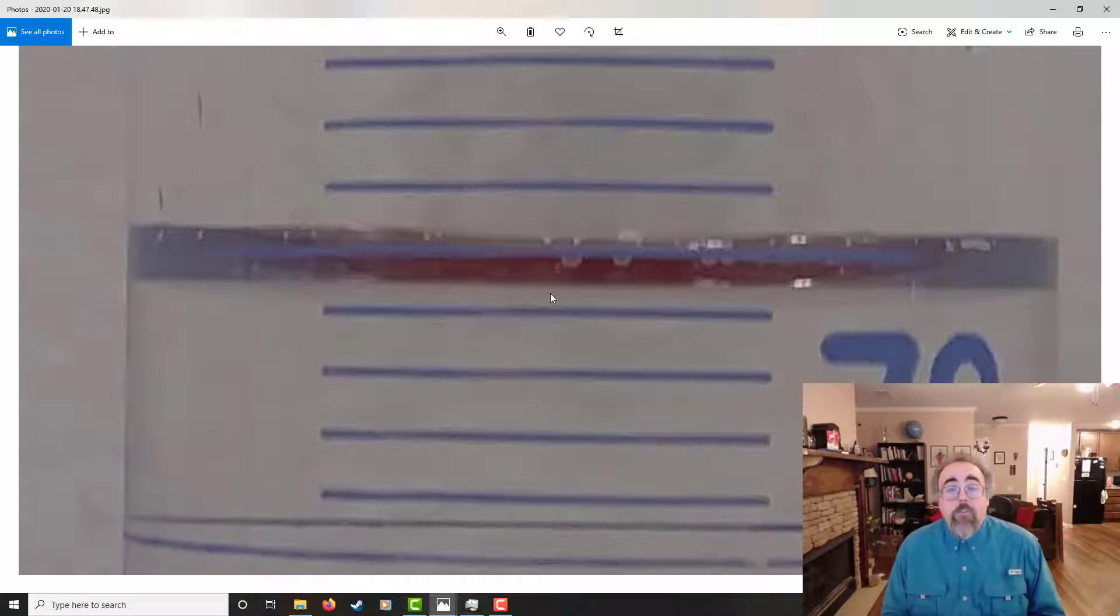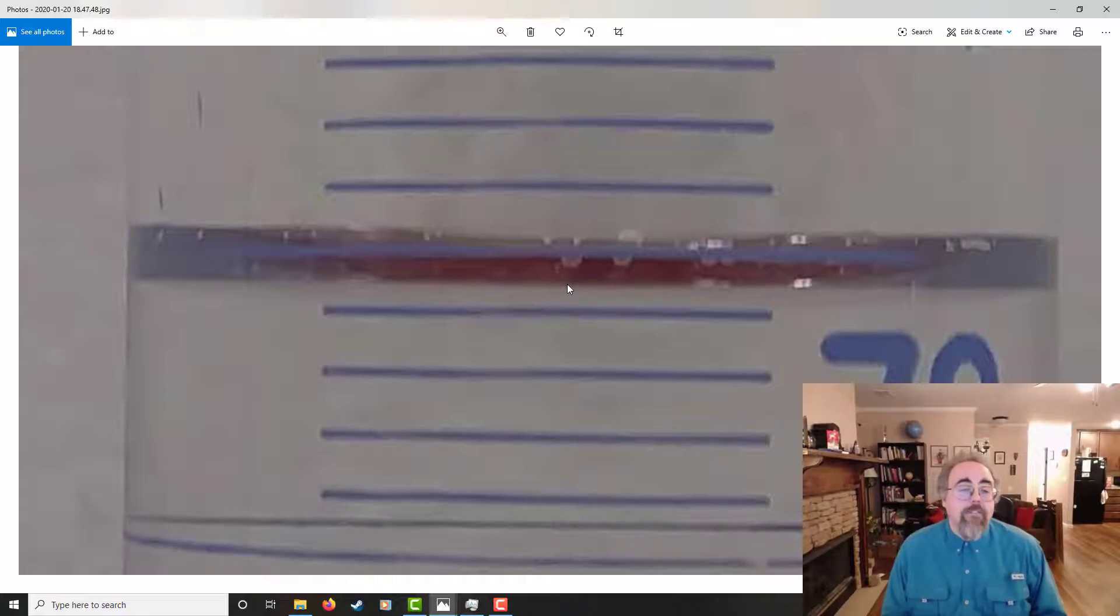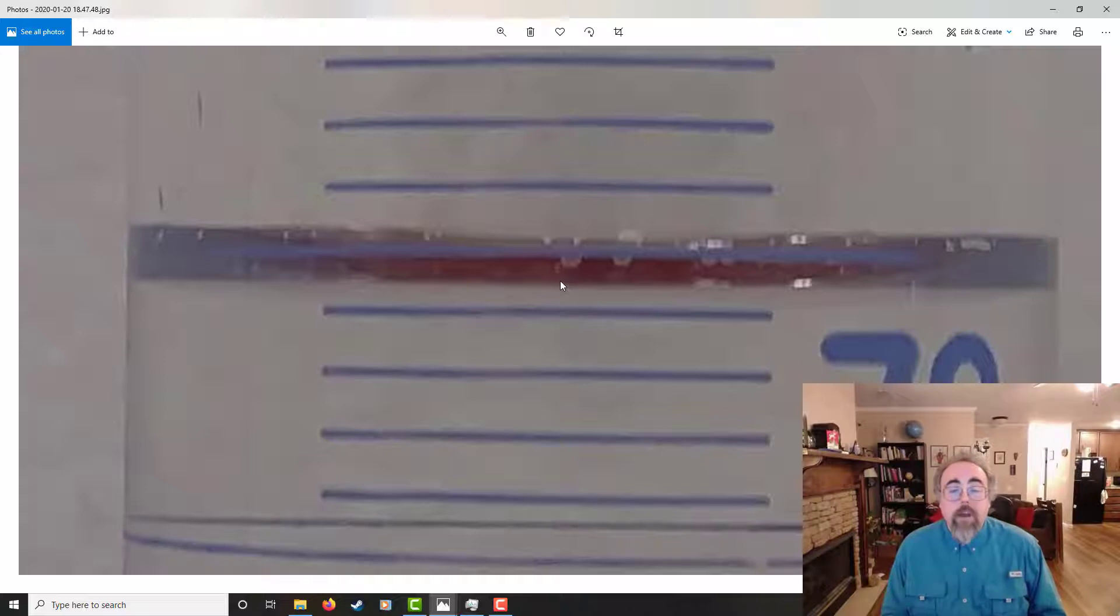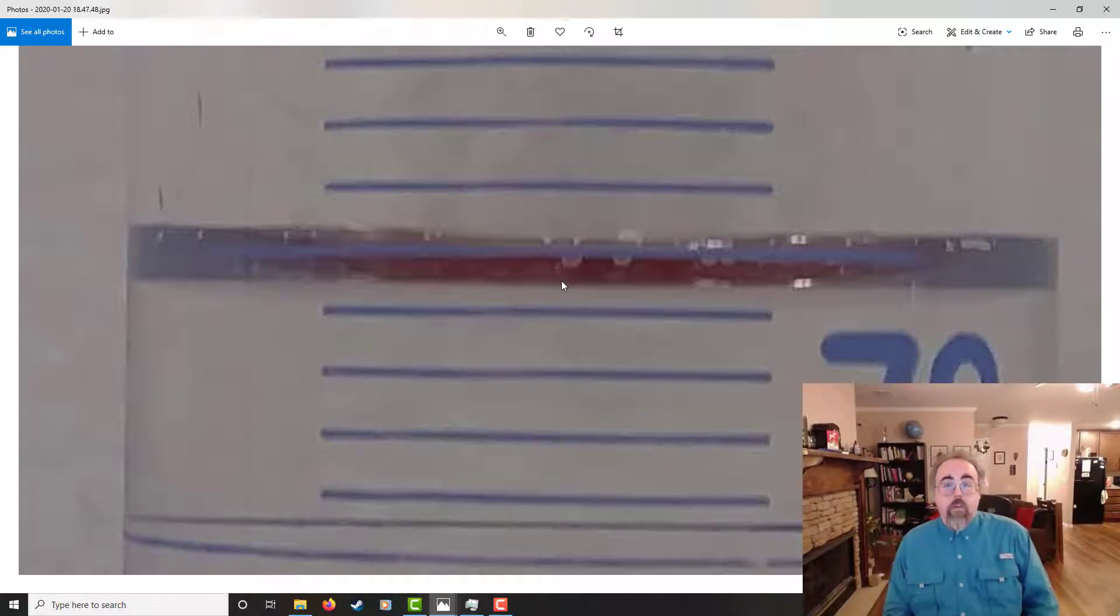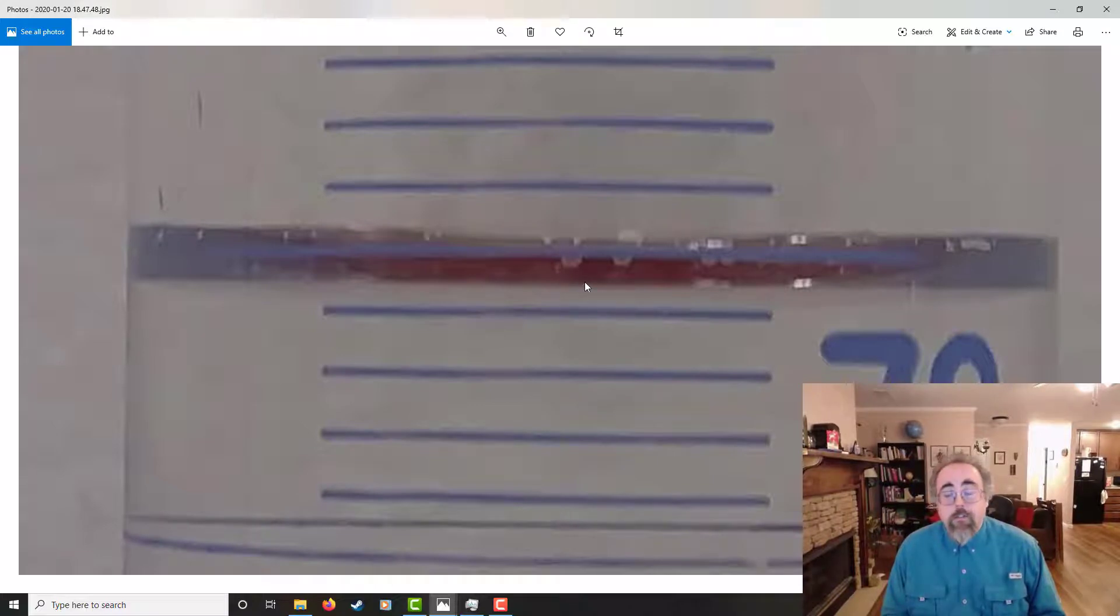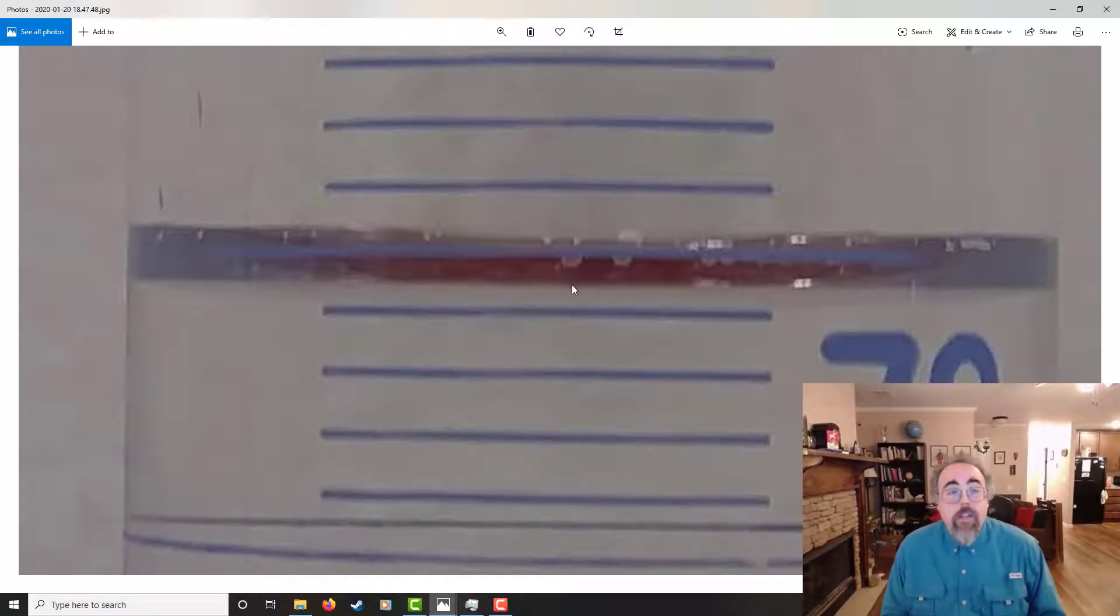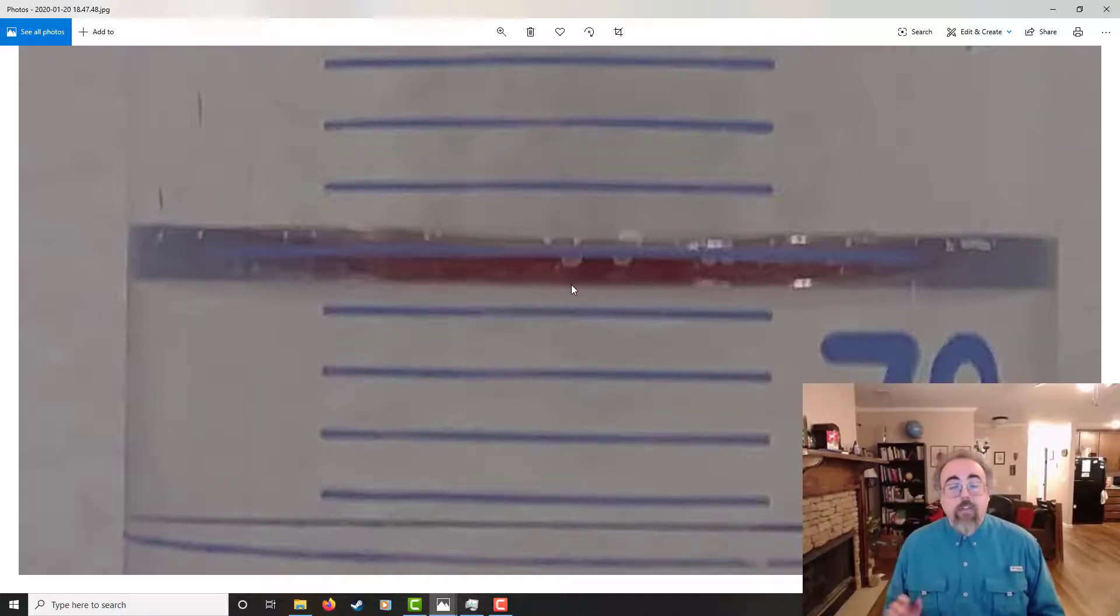I've got the two digits with my tick marks and then a third one, which is my estimated digit. And that's very valuable. That's still pretty legitimate. This is definitely within dozens, maybe a hundred or so microliters of 74.4 milliliters. That's pretty close. So I've got that, and that's good data. So I'm going to record that. So I'll say this is 74.4.